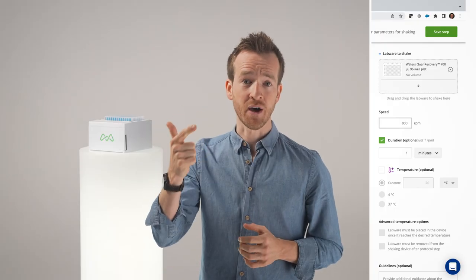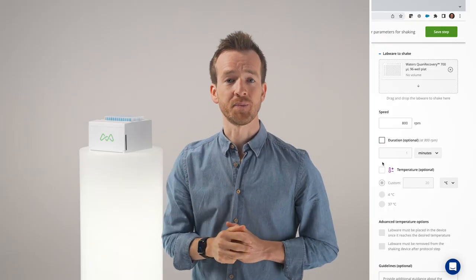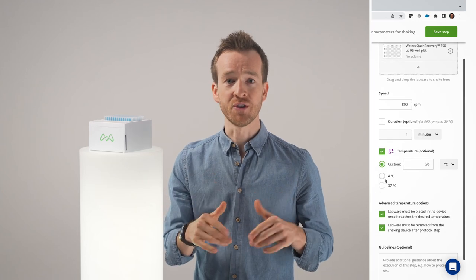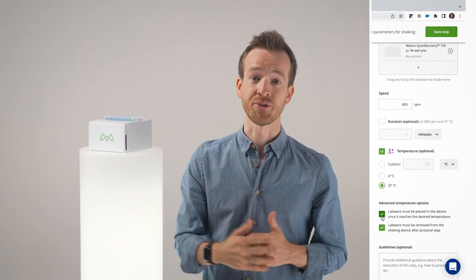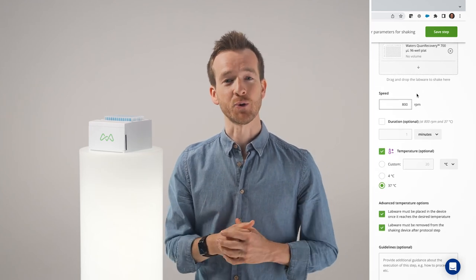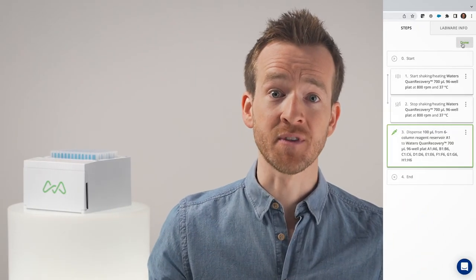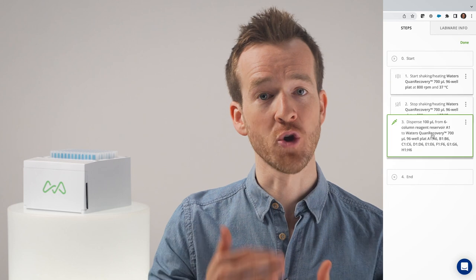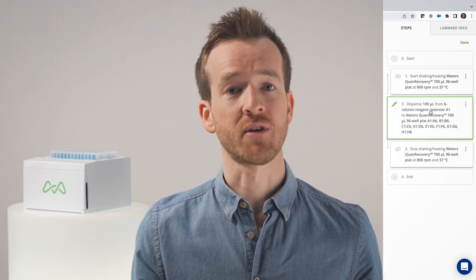the speed, the time, and the desired temperature. Make sure that you select a temperature above room temperature here so as to trigger the Heater Shaker Plus. Note that a Heater Shaker action can also be event-driven. This means that other steps can be embedded steps that will determine its duration, rather than a set timer.